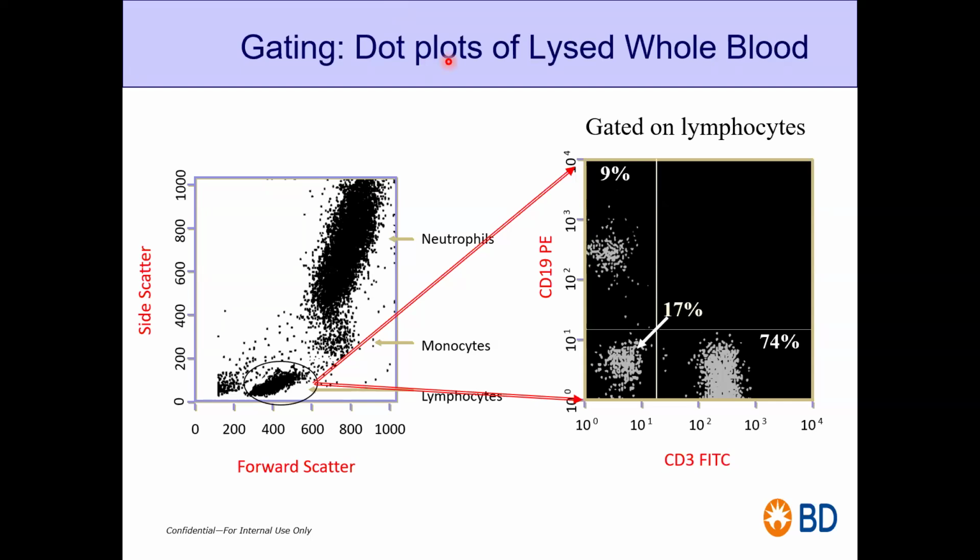How can we both? No, no, no. It's a negative, yeah, negative both, and then CD3 negative, CD19 negative. But I want to ask, what type of cells are they? If it's not CD3, if it's not CD19, what are these cells then? There must be something, right? If it's a lymphocyte, there must be something.